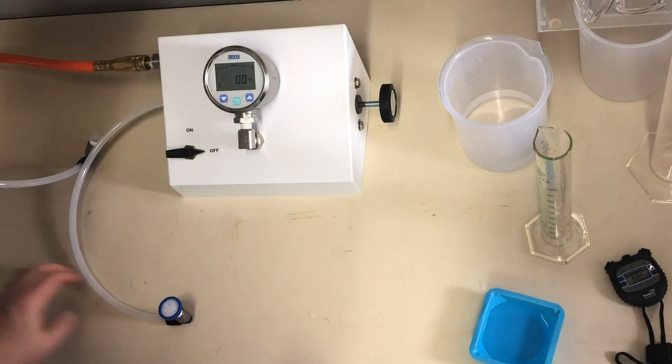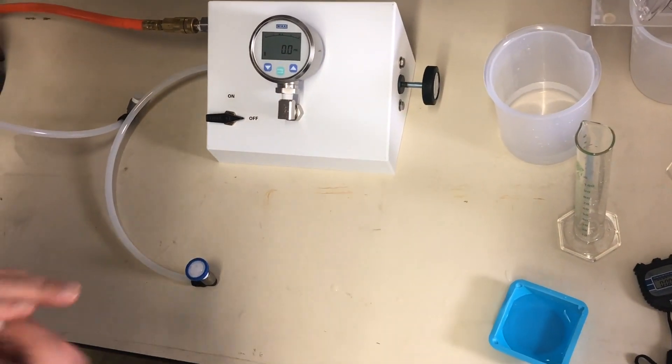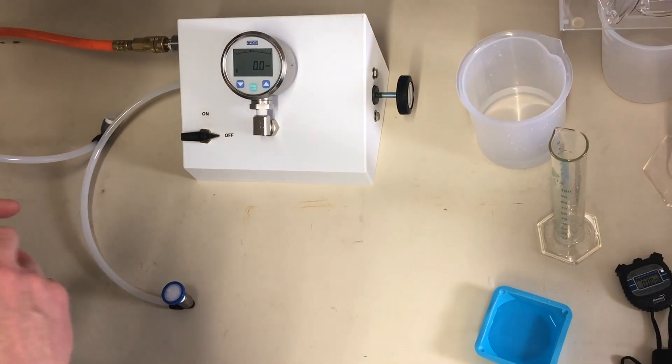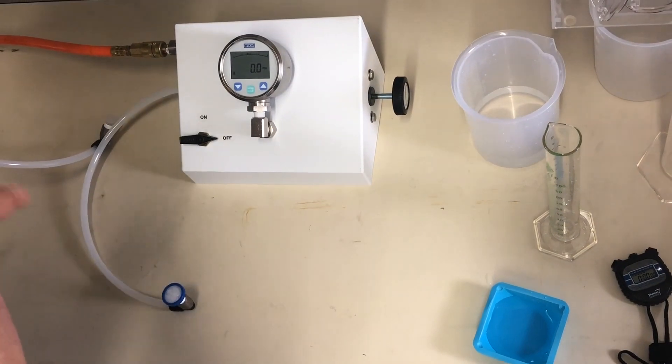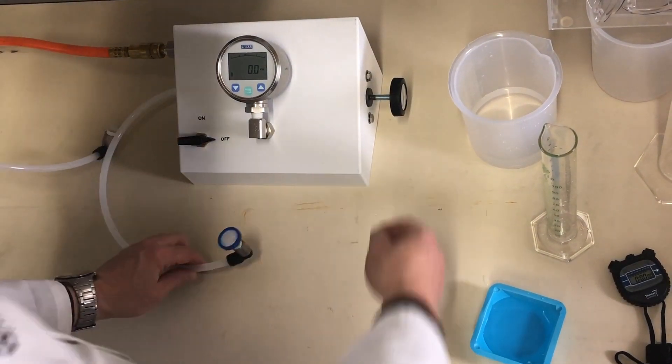We'll turn up the pressure to 50% of the bubble point. For a 0.45 mixed cellulose ester membrane — the particular filter that we're testing now — the bubble point would probably be somewhere around the high 20s to about 30 psi. So we'll turn it up to 15 psi.